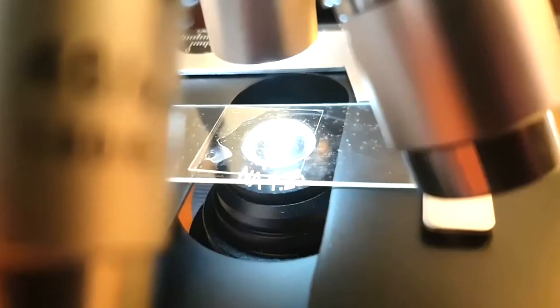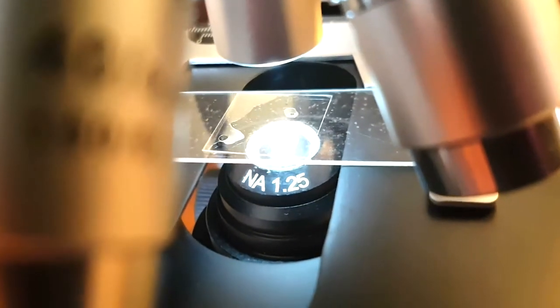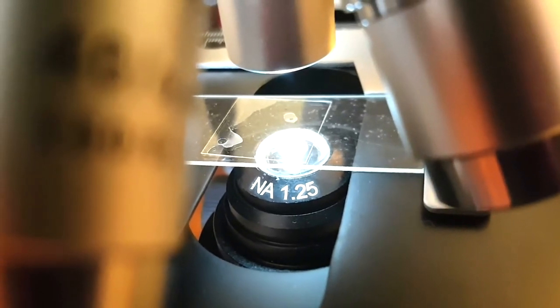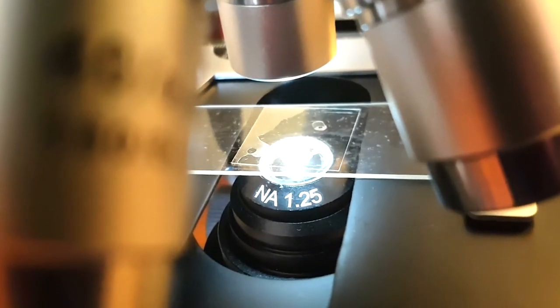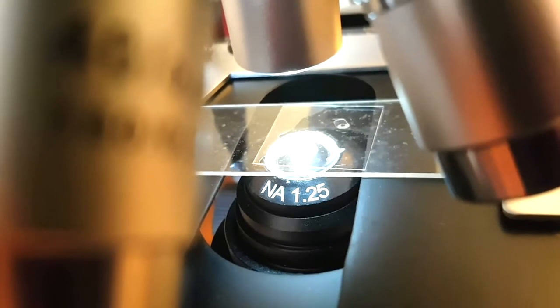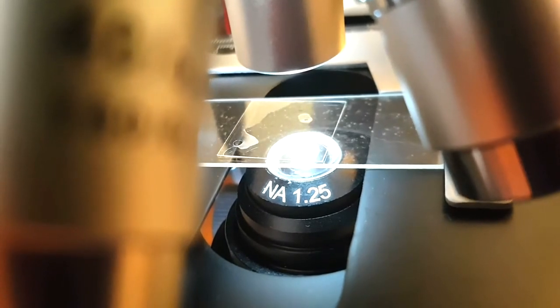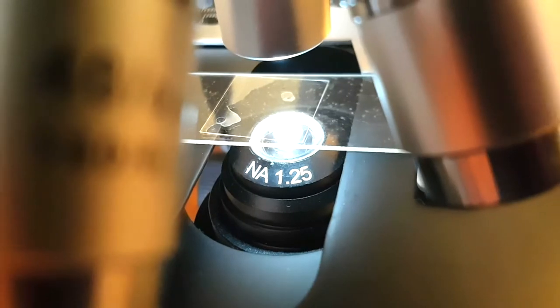Now, the cover slip is fairly small, but not in microscopy terms, it isn't. So basically, the way that I look through my sample is to start in one corner and then work along in slices. So I will start in the corner there, move the stage to the left and have a look through all of that, then move it towards me a little bit and then go back the other way again. And it's painstaking, but it's the only way to be sure that you've checked all of the microscope slide. So that's how I make sure I'm not missing anything.